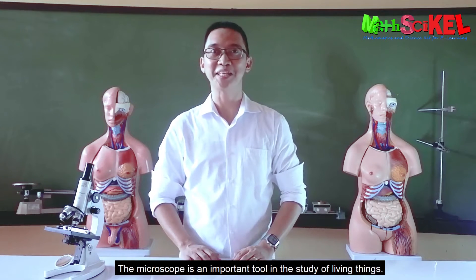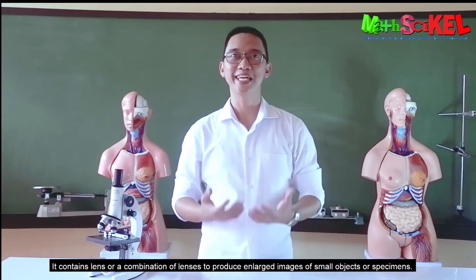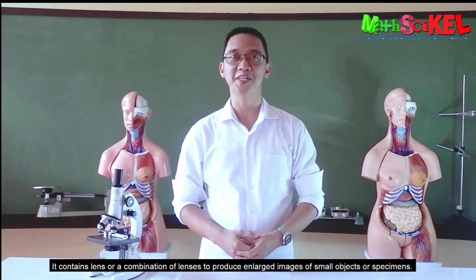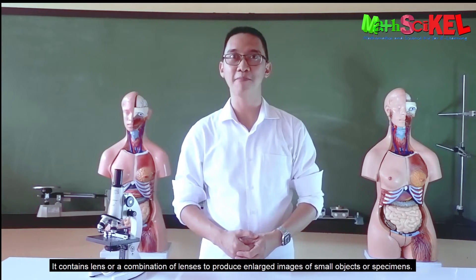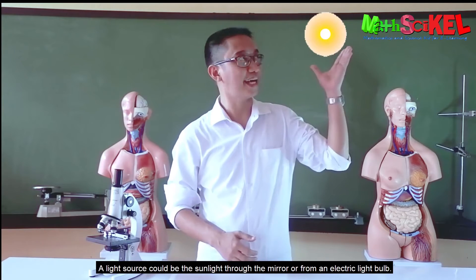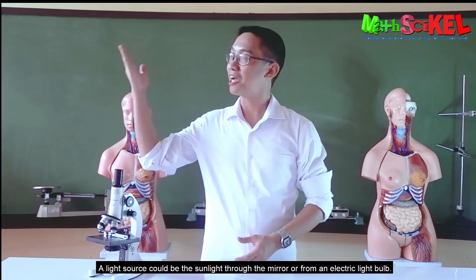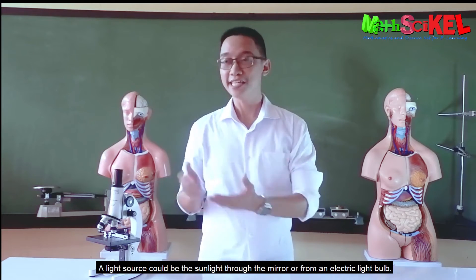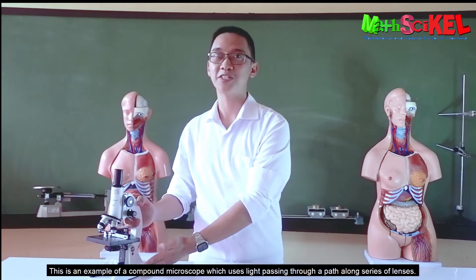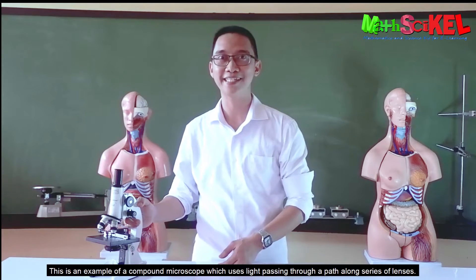The microscope is an important tool in the study of living things. It contains a lens or combination of lenses to produce enlarged images of small objects or specimens. A light source could be sunlight through a mirror, or from an electric light bulb. This is an example of a compound light microscope, which uses light passing through a path along a series of lenses.